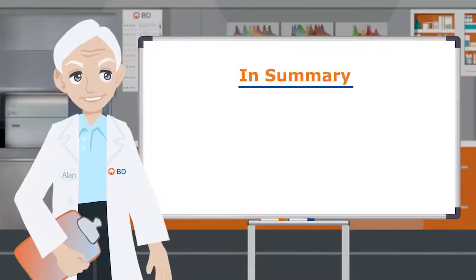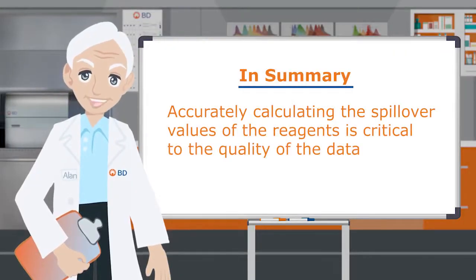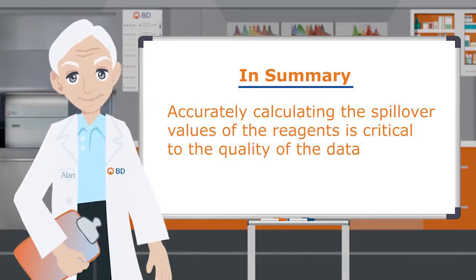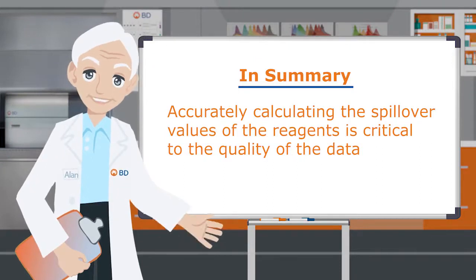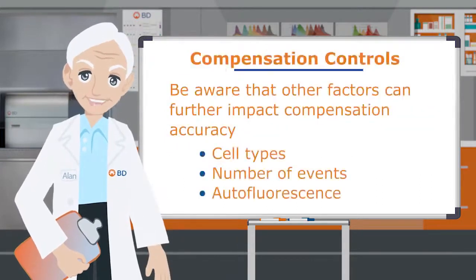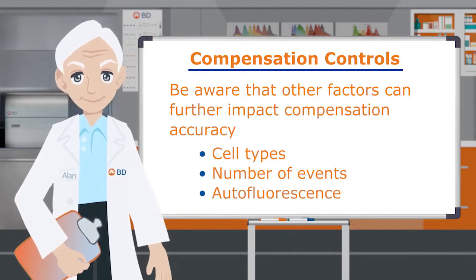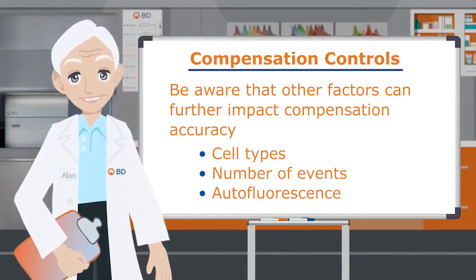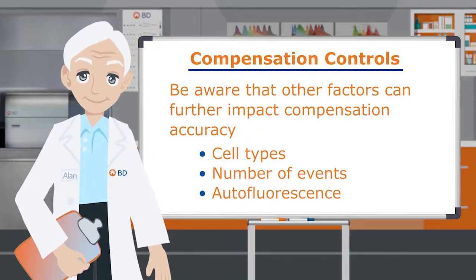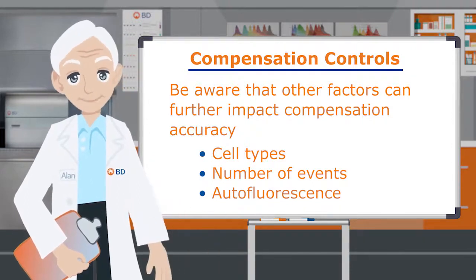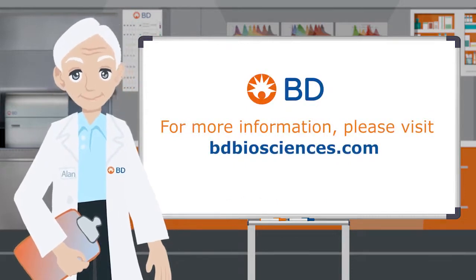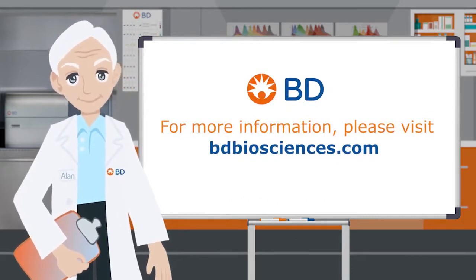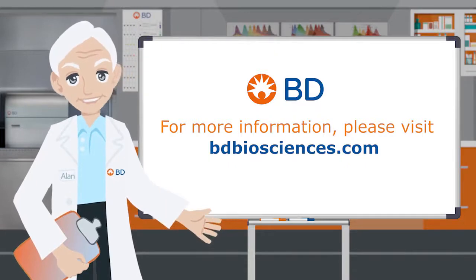In summary, accurately calculating spillover values of your reagents used in your multicolor assay is critical to the quality of the data from that assay. We have reviewed major sources of compensation errors. Be aware that other factors could also further impact compensation accuracy. By following the tips, tricks, and principles described here, you can maximize the overall quality of your multicolor assay. For more information about compensation or about the products featured on this video, please visit BDBiosciences.com.